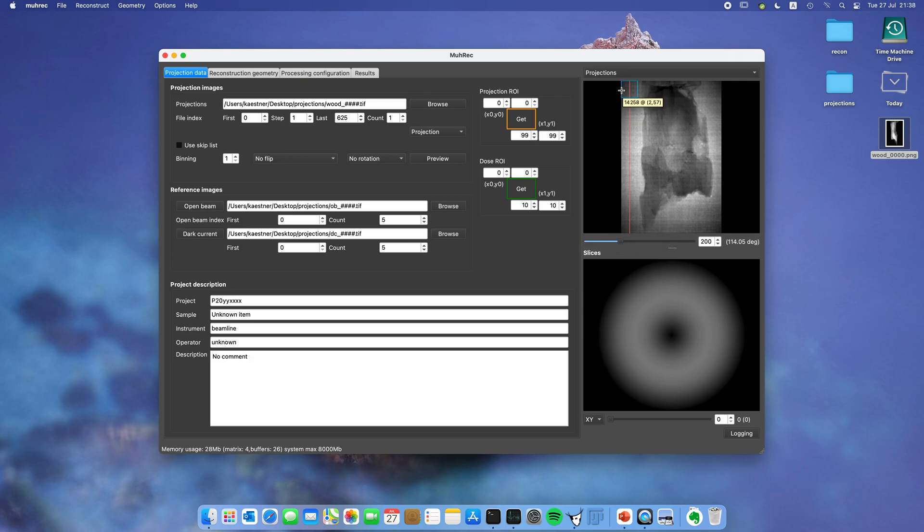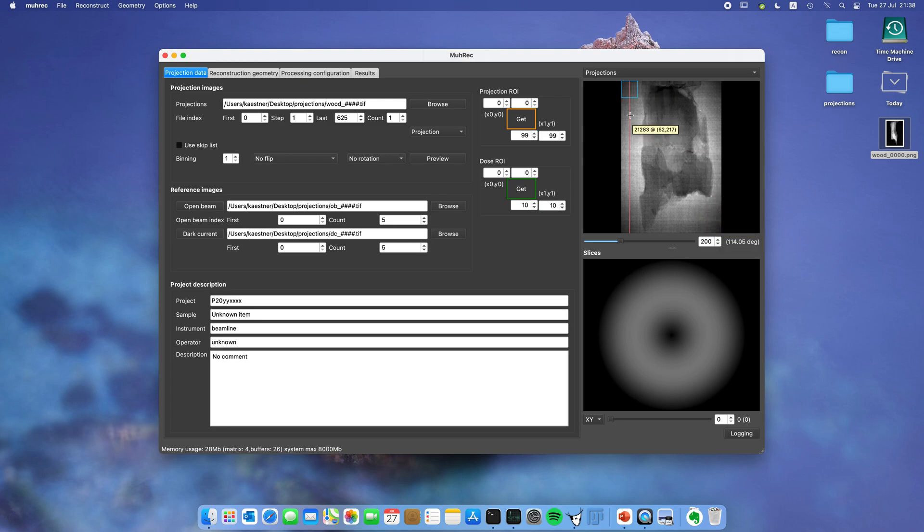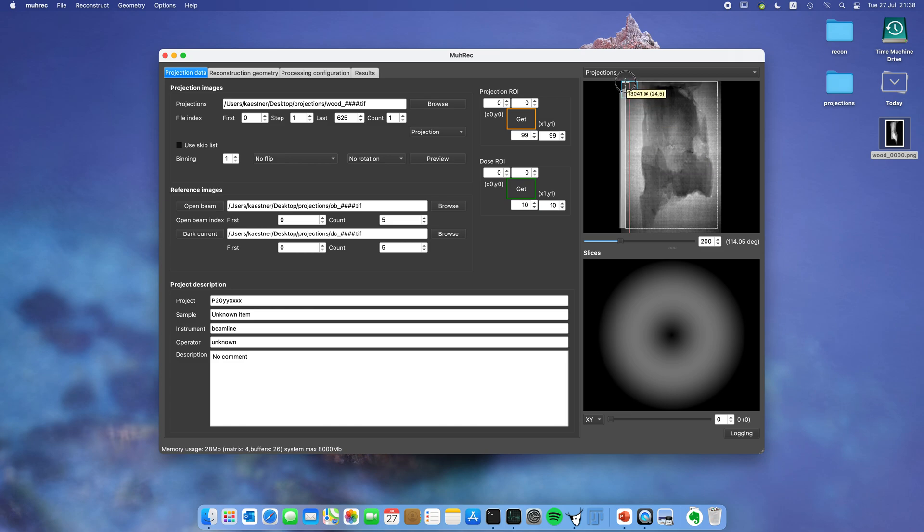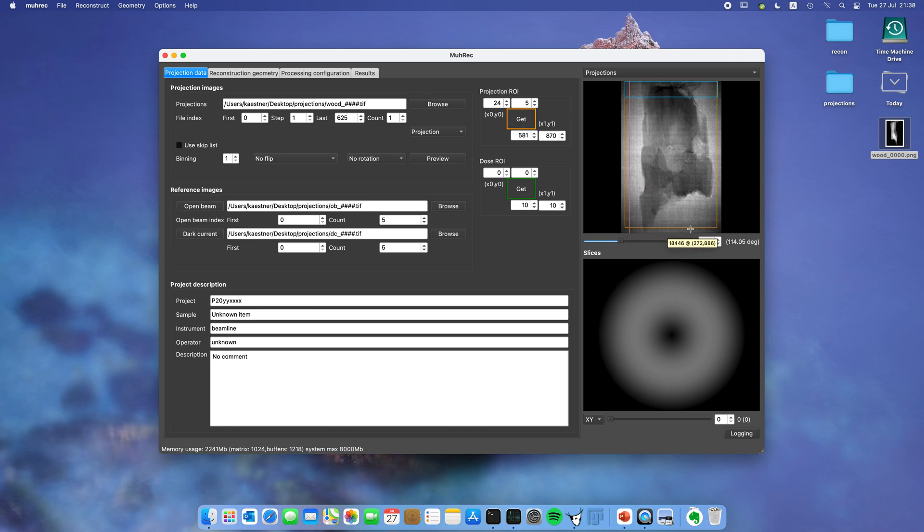Now we're going to select the region of interest that we'll make available for reconstruction. I want to select a region. Sometimes it doesn't work so well, so in that case start from the lower right corner and then it should work. I mark it like this and then click on projection ROI get. You can see it turns orange.